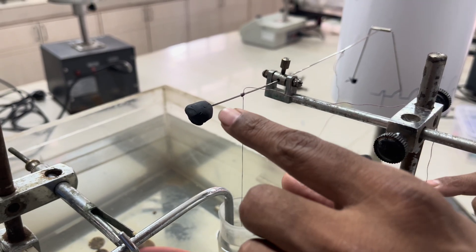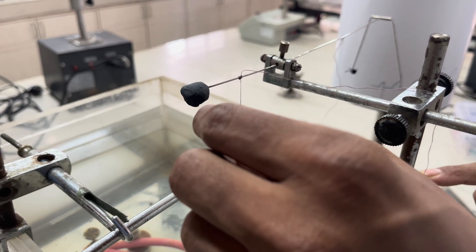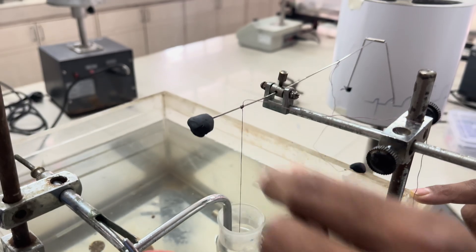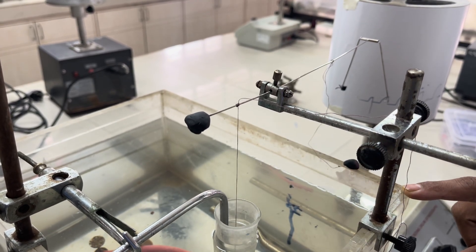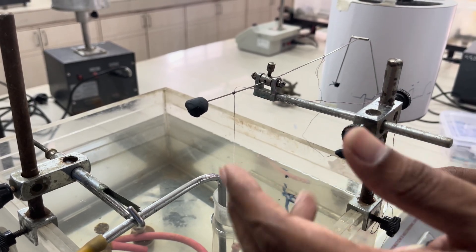For balancing purposes, you have to use wax. The amount of wax to be applied depends on the type of tissue — whether it is smooth muscle or skeletal muscle.